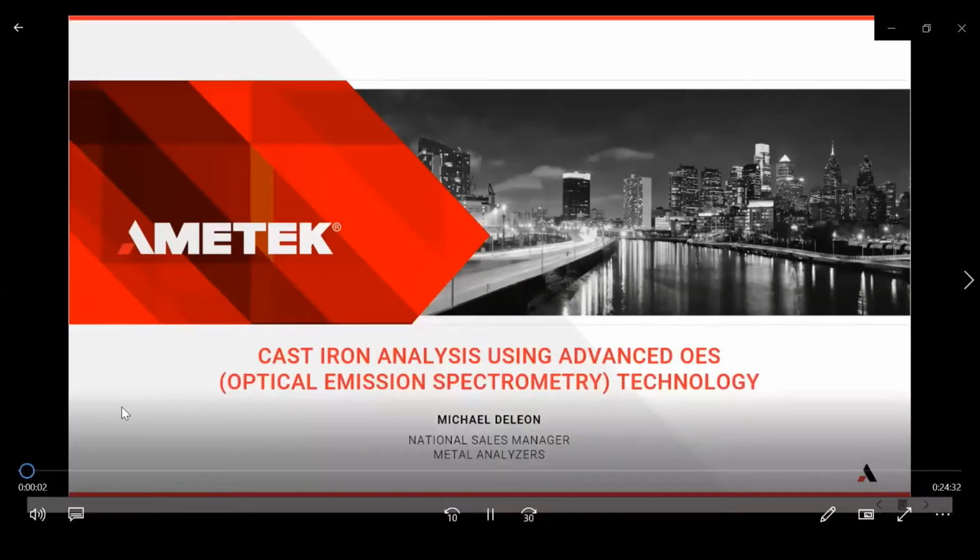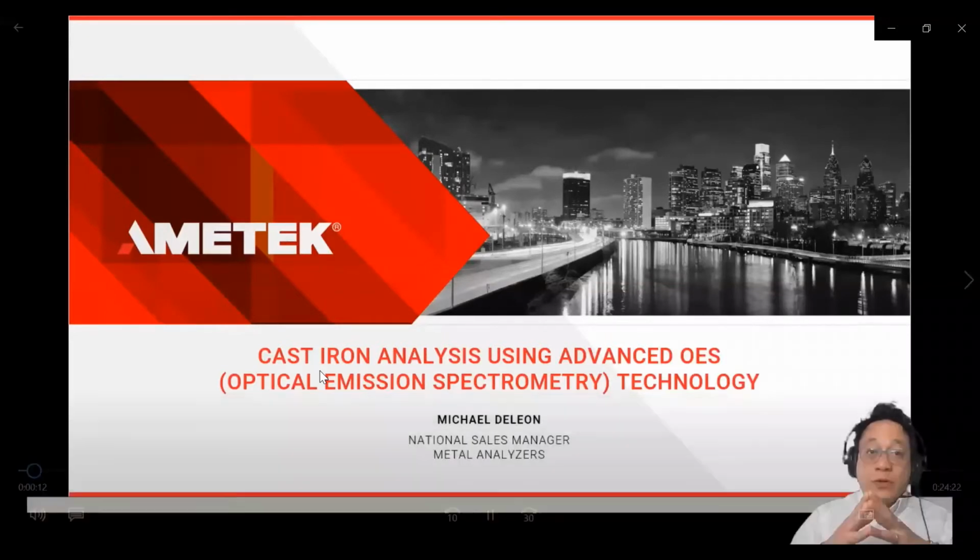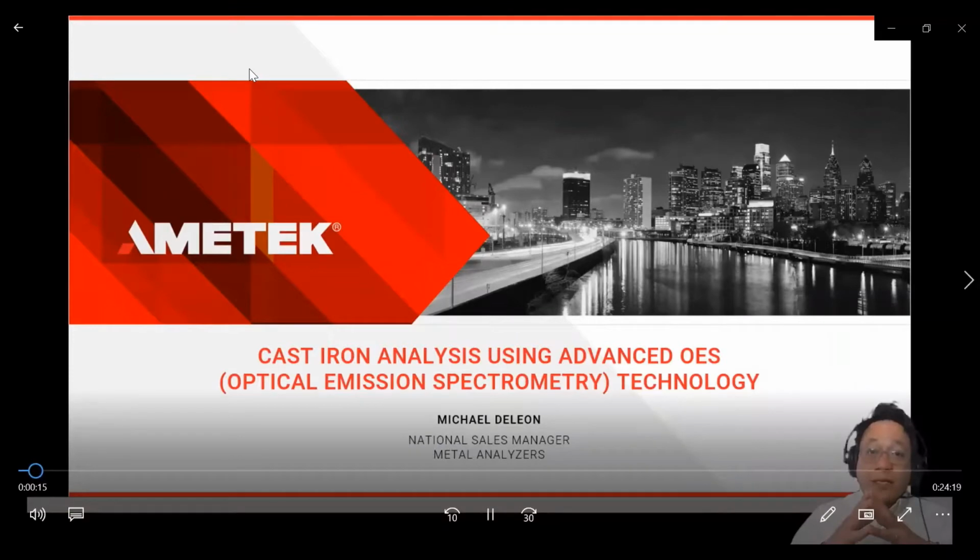Thank you, and welcome to our webinar today. My name is Michael De Leon, and I am the U.S. Metals Analysis Sales Manager at Spectro Analytical Instruments. Today, I would like to present an opportunity for the determination of carbon in cast iron using a spark spectrometer.